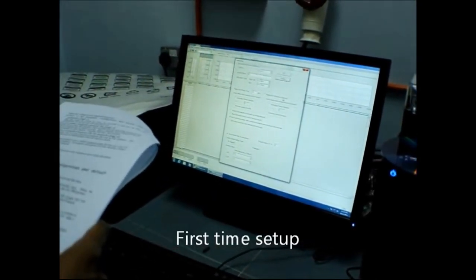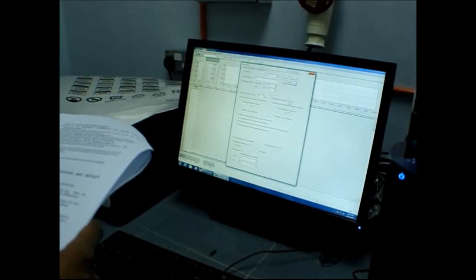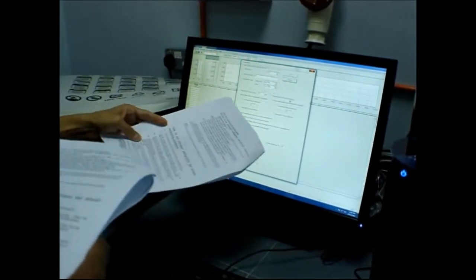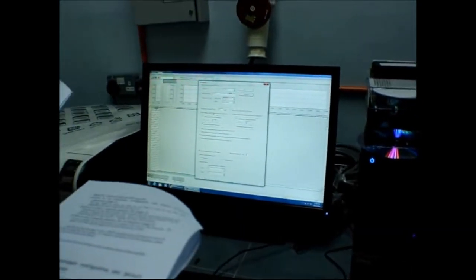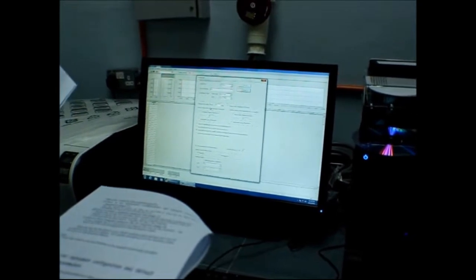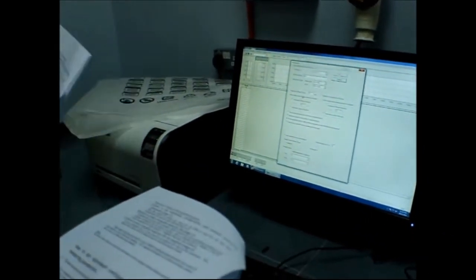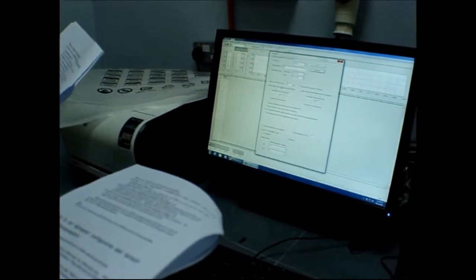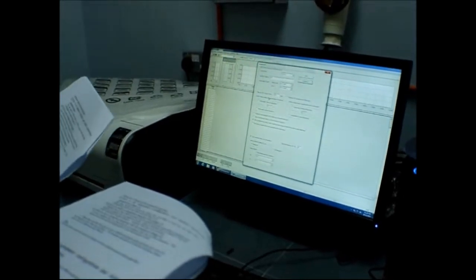If sample concentration is high, to avoid contamination it is better to increase rinsing time. So flame AC means your auto sampler. Rinsing time is 10 seconds. 10 seconds should be enough, unless your concentration of sample is very high, then you may increase a little bit. If not, 10 should be enough. Flame auto rinsing no need.